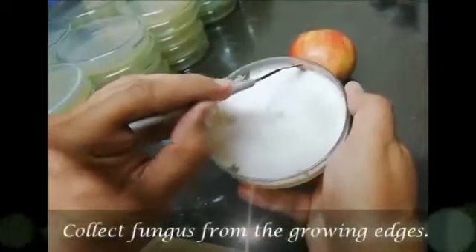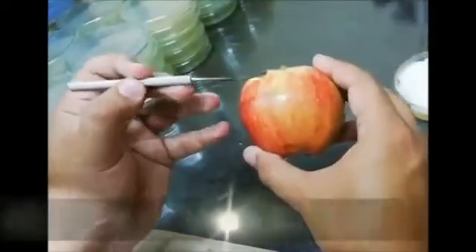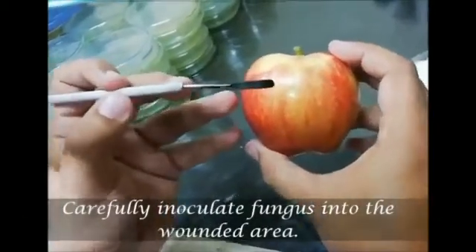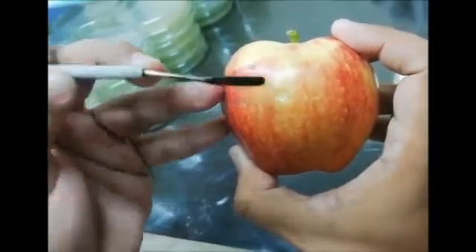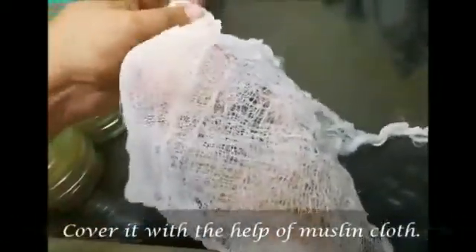Collect fungus from the growing edges and carefully inoculate it into the wounded area. Cover it with the help of muslin cloth.